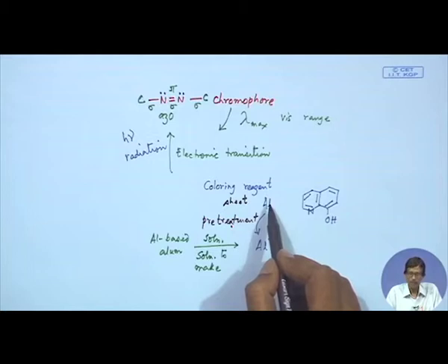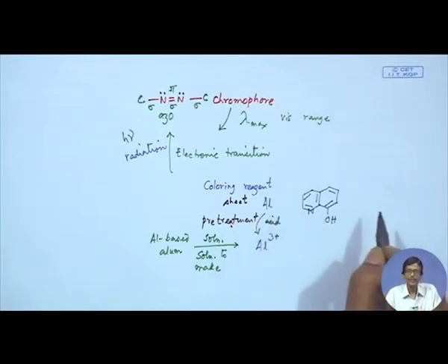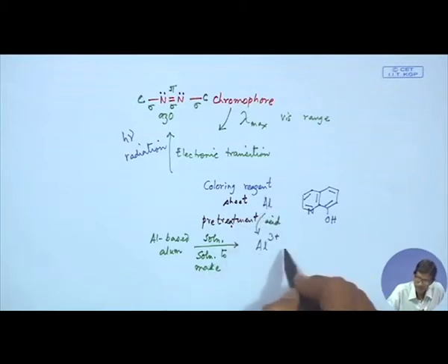But in this particular case, to go for this aluminum sheet or wire, you have to go for some treatment with acid. So, acid digestion treatment will be there such that aluminum will be oxidized to aluminum 3 plus.